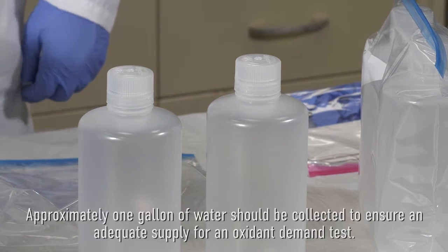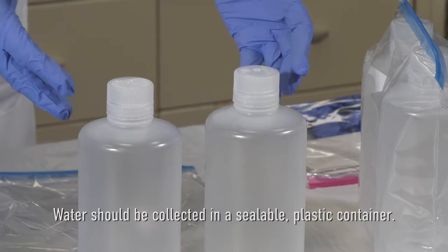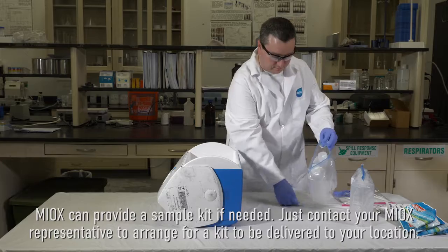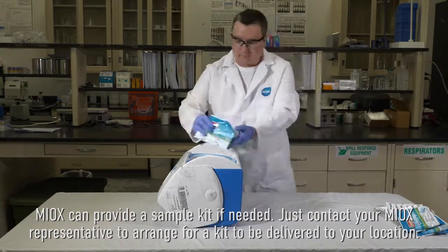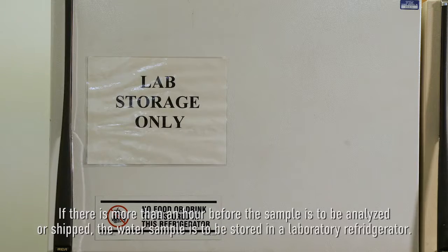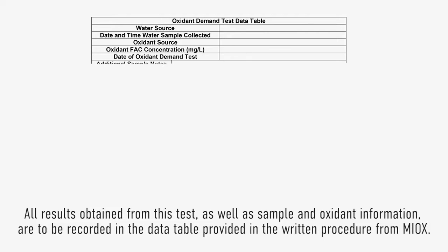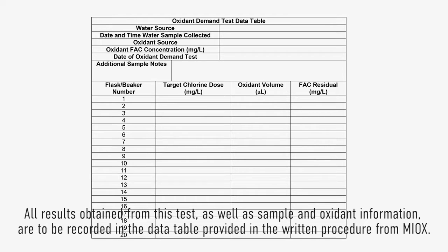Approximately 1 gallon of water should be collected to ensure an adequate supply for an oxidant demand test. Water should be collected in a sealable plastic container. Miox can provide a sample kit if needed. Just contact your Miox representative to arrange for a kit to be delivered to your location. If there's more than an hour before the sample is to be analyzed or shipped, the water sample should be stored in a laboratory refrigerator. All results obtained from this test, as well as sample and oxidant information, are to be recorded in the data table provided by the written procedure for Miox.